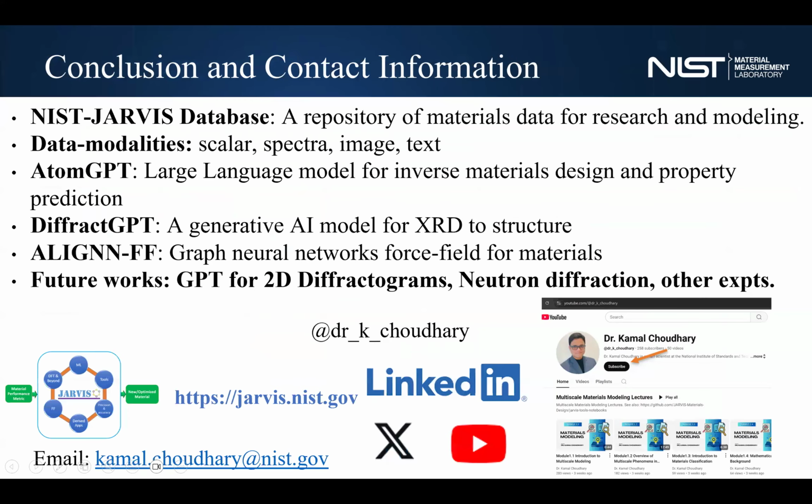So in this talk, we learned about the NIST JARVIS infrastructure, different data modalities, AtomGPT, DiffractGPT, ALIGNN-FF, and in future, we'd like to extend this GPT for not just 1D but 2D diffractograms, neutron diffraction, and other experiments.